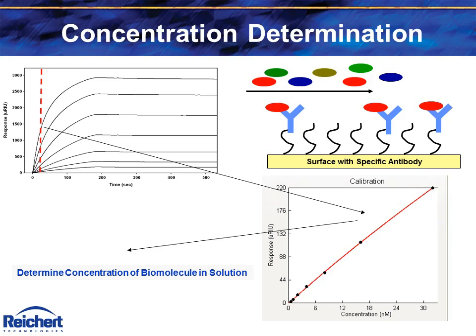Points in the nonlinear parts of the response curves or dissociation can also be chosen and fit via nonlinear regression. Generally, a number of different time points are tried to determine the best fit.